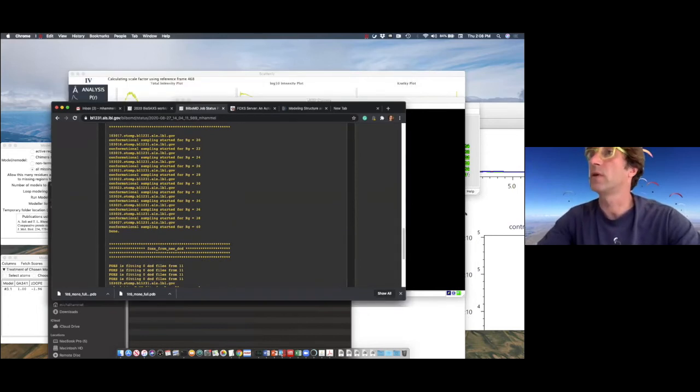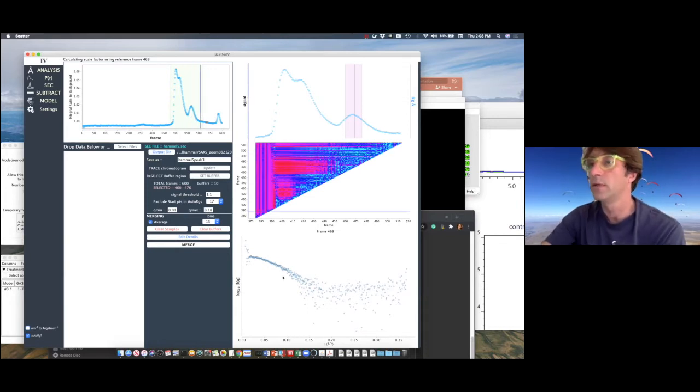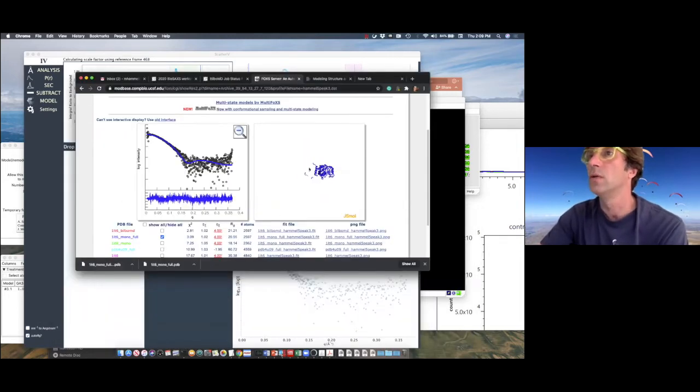Okay, so let's go back to the case we started with. We remember this complicated size exclusion profile with aggregation, split two peaks, and the last peak with small molecules. So let's calculate shape for these. I already confirmed, and again, when we look at the Fox fit, right here, that this is the molecule that is at the small peak rather than this one, okay?